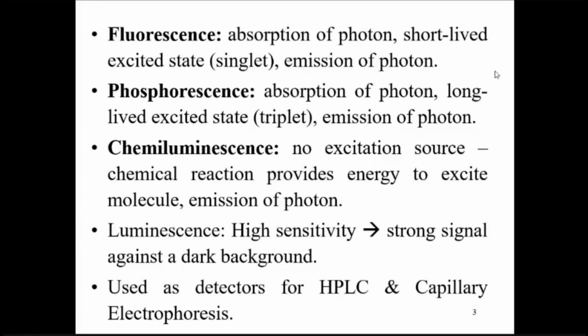Luminescence is associated with high selectivity. When we say selectivity, it means out of many molecules, only a few will be associated with luminescence. It is also associated with high sensitivity.